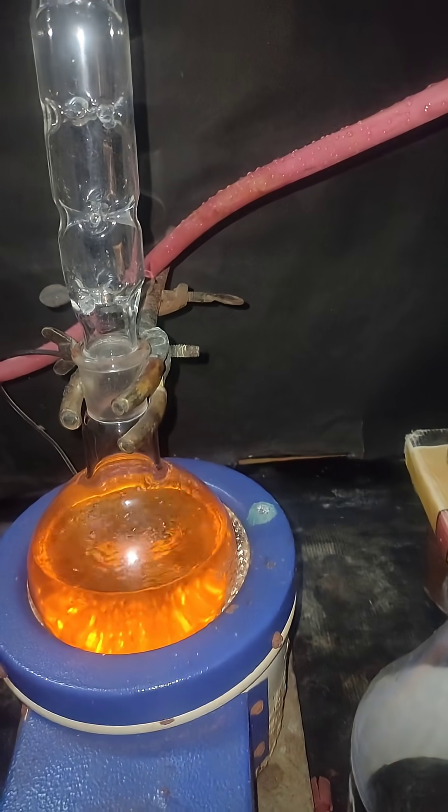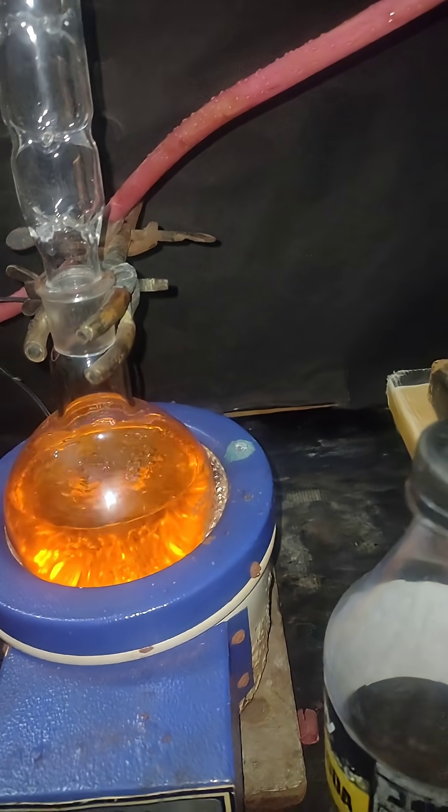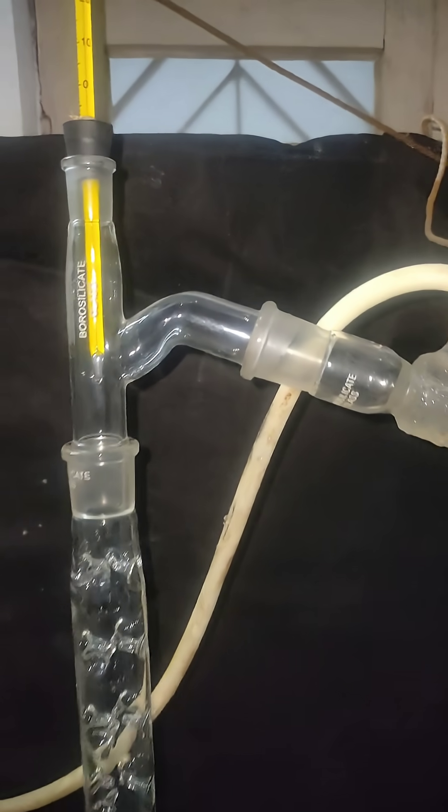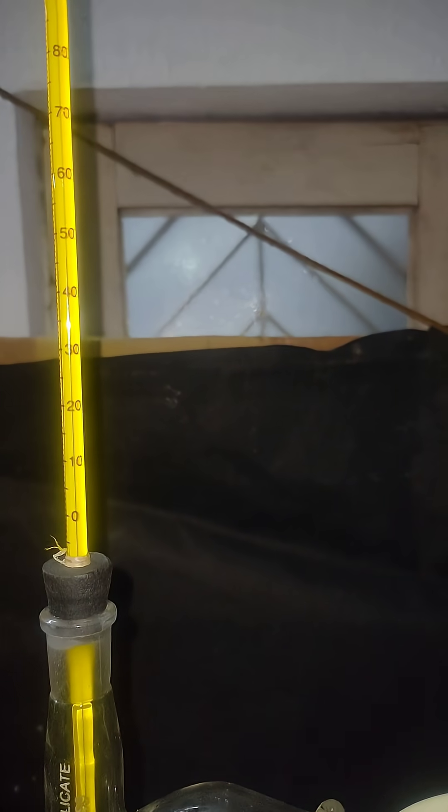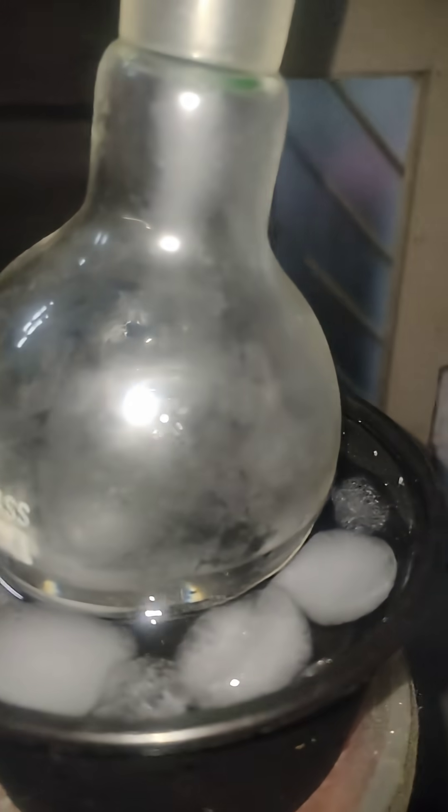Over here I am distilling petroleum ether from petrol. I have set up a vigreux column and you can see the temperature is between 40 and 50 degrees Celsius. Ice-cold water is being supplied in the condenser, and here is the receiver where I have collected a fair amount of petroleum ether.